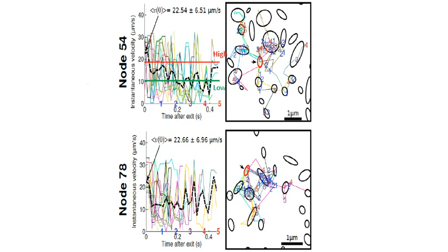Here this is an example where it is quite isotropic. Here the anisotropy is not very clear because probably there was not necessarily some network here. But what we found in general is that there was a clear isotropic distribution, that is, trajectories could escape in all possible directions starting from a single node.